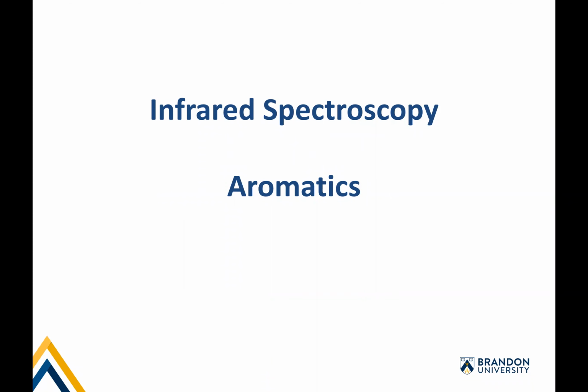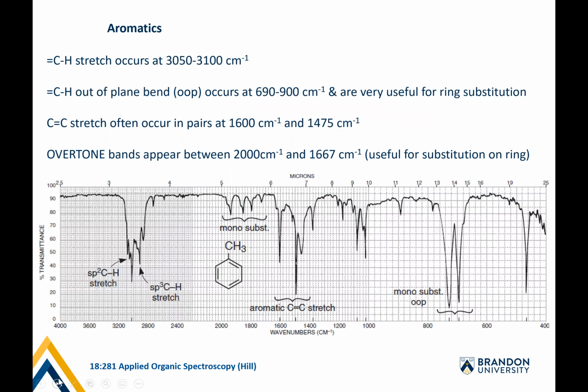Okay, class. So what we're going to do next is talk about the absorption trends of aromatic compounds in infrared spectroscopy. This is following right on the heels of the alkanes, alkenes, and alkynes. So aromatics. In many ways, they are similar to the alkenes, but there are a couple of notable differences.